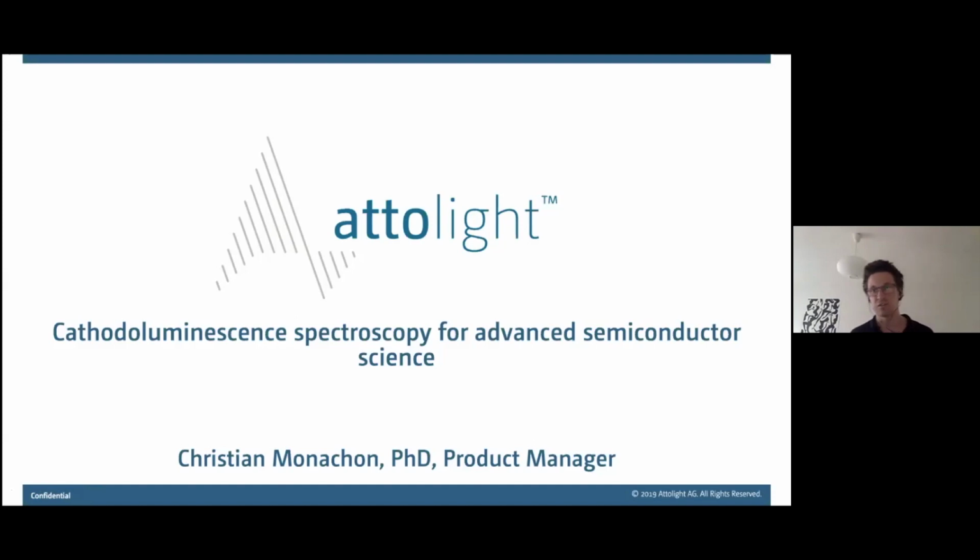And I'm here to basically talk a little bit about what we use this tool for, what is cathodoluminescence spectroscopy, and how it can help you. So the title of the talk is Cathodoluminescence Spectroscopy for Advanced Semiconductor Science. You'll see that it spans quite a few types of materials and problems.